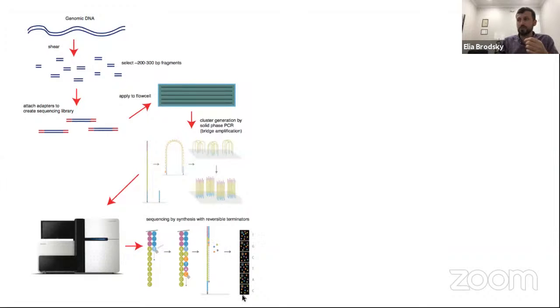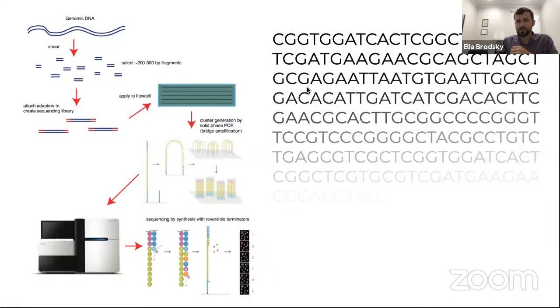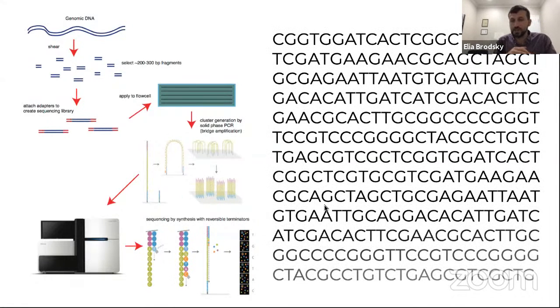And then we have these images, and that's where this quality score is coming from. The quality score is from the analysis of these images to give us an insight into how clear that signal was. So as a result, we have this long sequence. As the process of sequencing happens, we have these long sequences coming out, and the sequences are in short pieces. So when we get FASTQ reads or FASTQ files out of a sequencer like this, shotgun sequencing, one of the major challenges is to then annotate, to understand where that particular read came from.